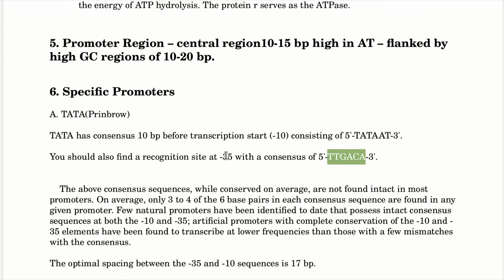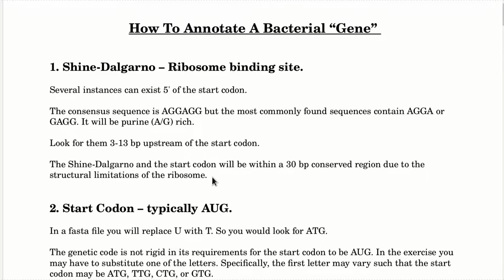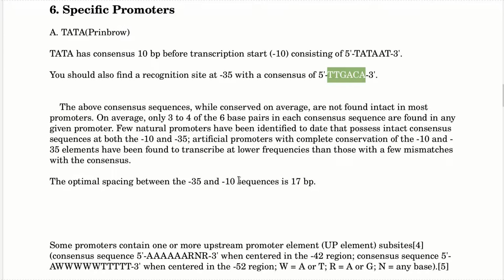If you remember up with this one, this 30 conserved here. There's a similar kind of thing going on here, that there's a kind of region that they have to be within a certain distance of each other. I've certainly never seen one of these that are further out than -51 or 52. I've seen this one right on at 0, or at essentially -1. I've seen this one where it's like part of the start codon.